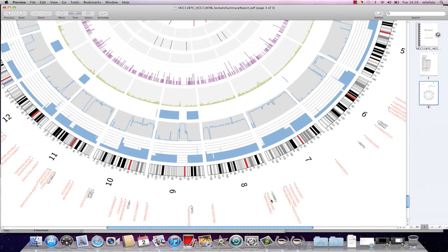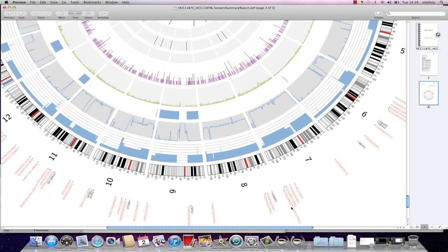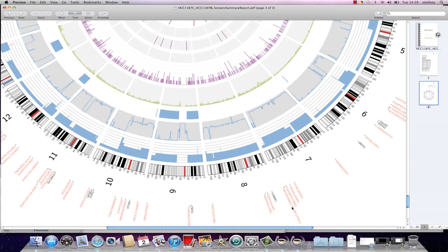In the outer ring, multiple non-synonymous variants are highlighted, including ABCB8 on chromosome 7, with the protein change A to G. This mutation has previously been identified in this cell line in a publication in Science in 2007.